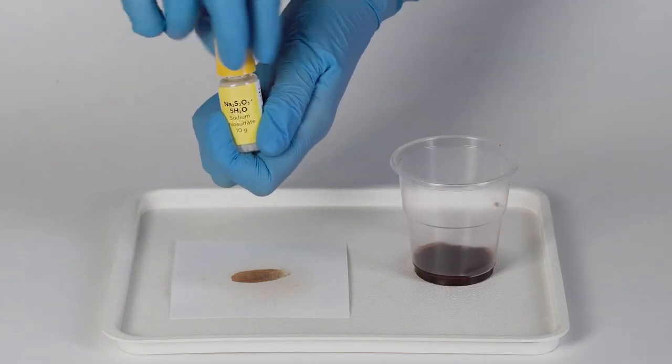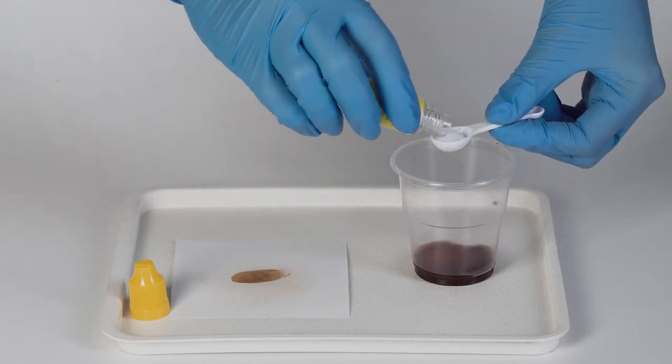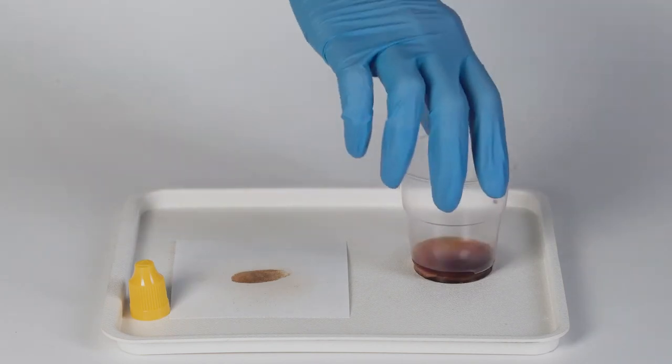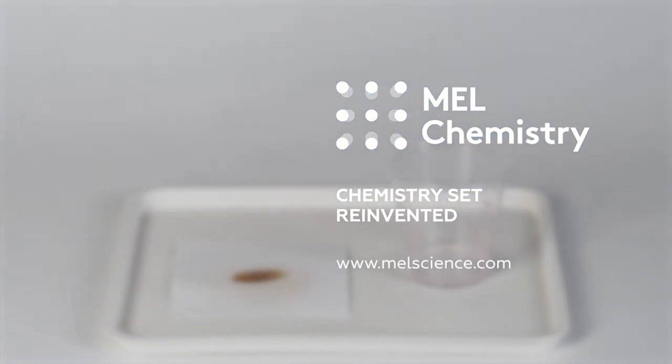Neutralize the rest of the iodine with the help of two big measuring spoons of sodium thiosulfate. Pour the solution down the sink and wash away with an excess of water. Learn more about this experiment on our Mel Science website.